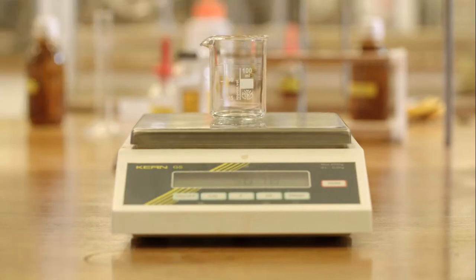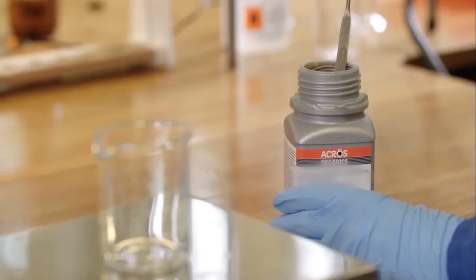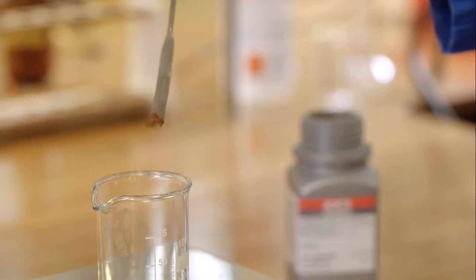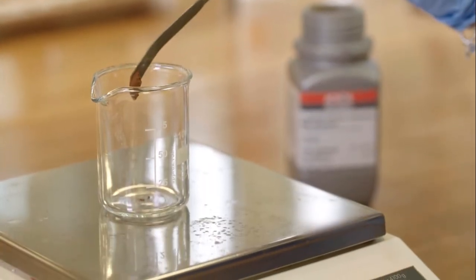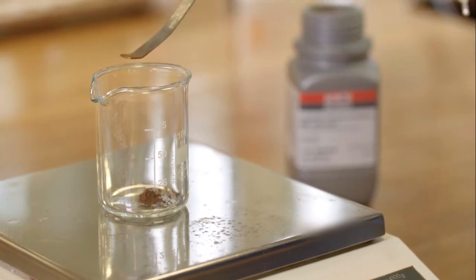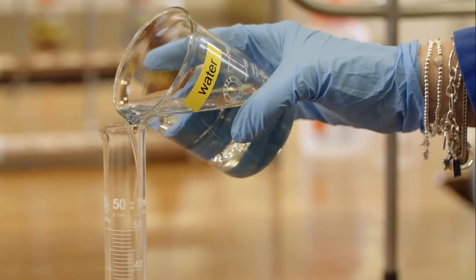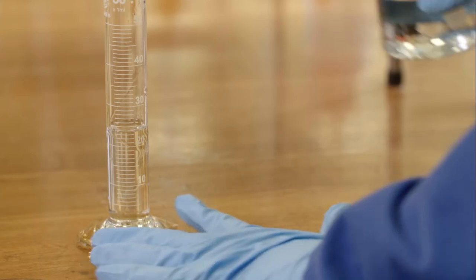First, the mass of an empty beaker is recorded. Then, 1 gram of copper chloride is added to the beaker and the mass is recorded again. 25 centimeters cubed of water is measured into a measuring cylinder and added to the beaker.